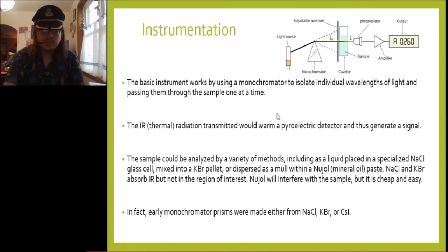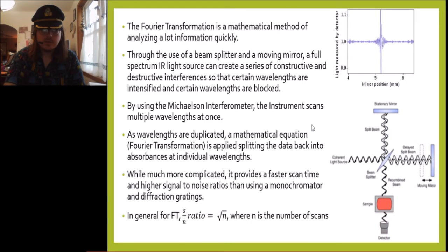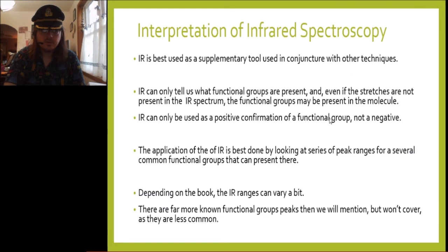Now I'm going to go ahead and skip through the instrumentation, but just know that there are many different ways we can work through this. The more important thing is looking at and interpreting the IR.